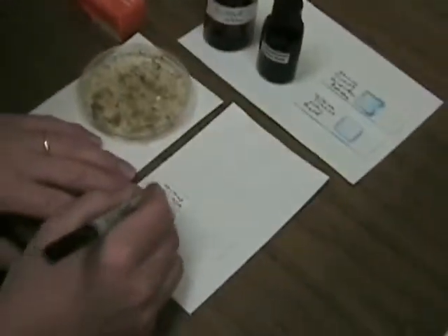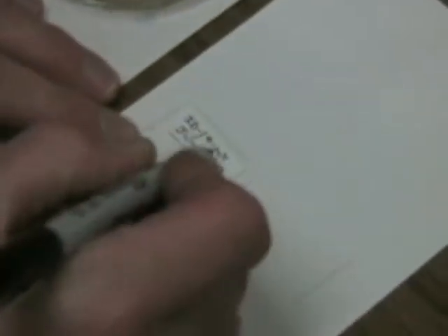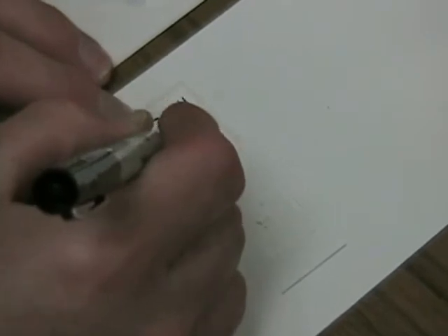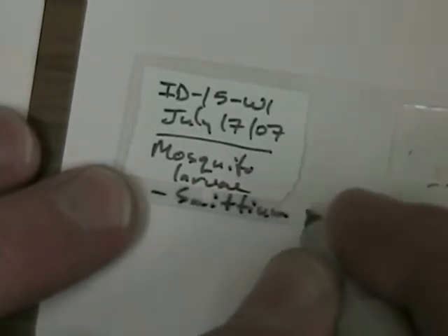What we'll do here is a demonstration of how to preserve a slide. Just important in terms of record keeping is to have a specimen ID, a date, and usually some description such as a mosquito larva and the name of the fungus if you have that.